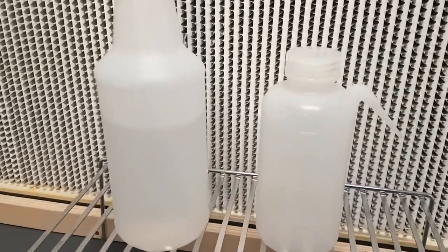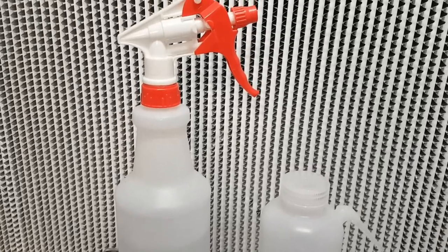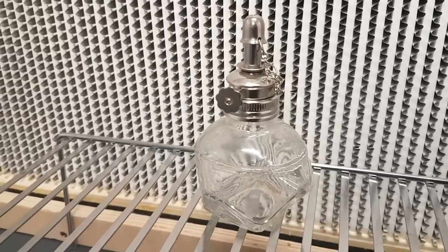Another critical thing to have is isopropyl alcohol. You'll use it to wipe down your table surface, fruiting blocks, and grain jars before inoculation to keep everything clean. Rather than using the original bottle, it's much easier to use a little squirt bottle or spray bottle to apply alcohol to a paper towel or spray directly on surfaces — also more economical. On the same topic, consider getting an alcohol lamp. These are really useful for having a flame to sterilize your blade during transfers; you could use a Bic lighter, but it can be cumbersome.